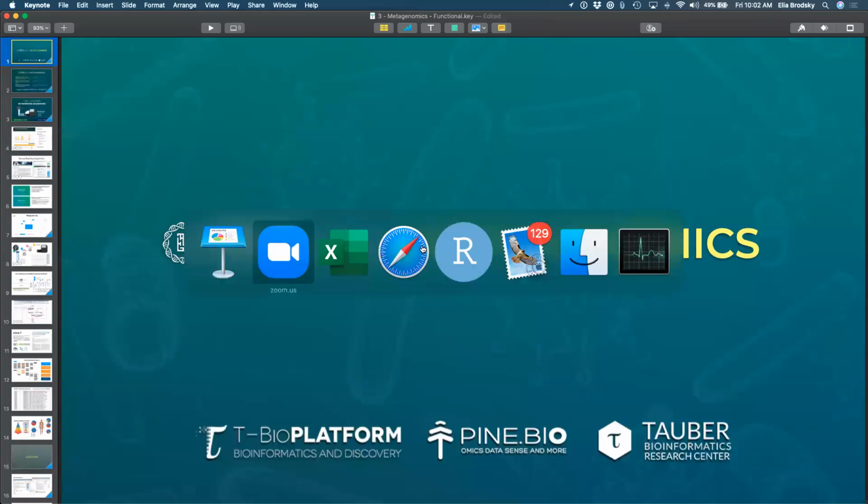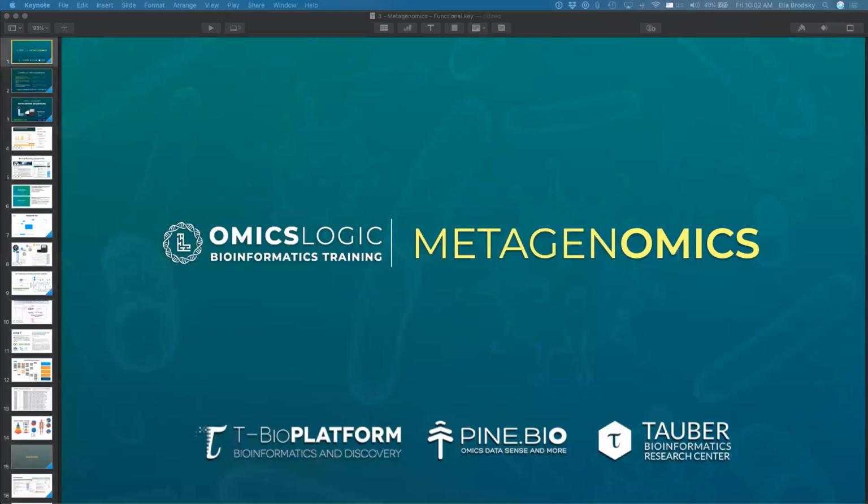So we are going to try and do a couple of things. These couple of things are going to include a little bit of R, just a tiny little bit to get those of you that don't know R started. And for those of you that already know R, this is going to be a little bit basic at some point, but I hope that the approach is going to make sense.